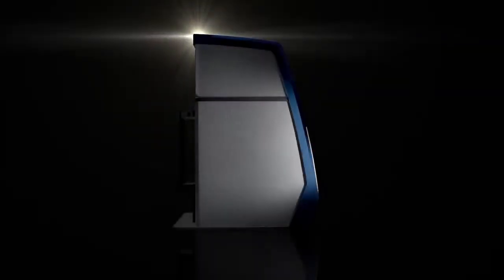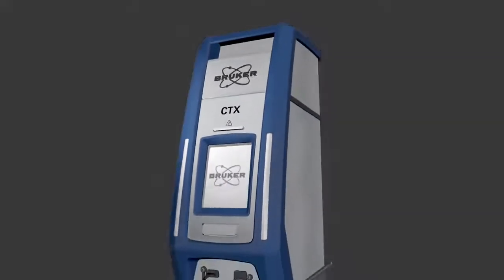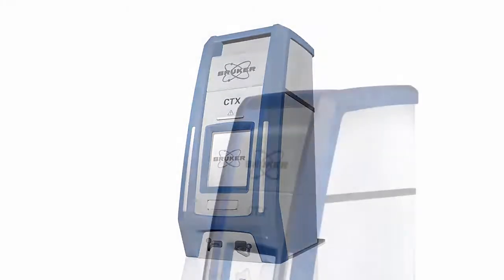Bruker introduces the new CTX, a portable, lightweight, small footprint, self-contained, battery-operated, and safety interlocked countertop XRF elemental analyzer.